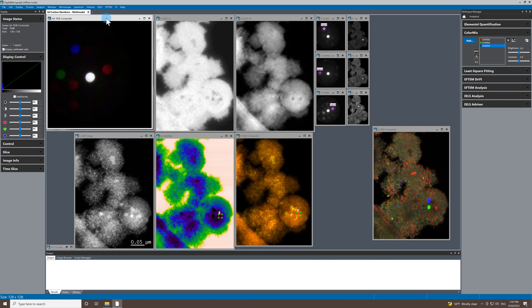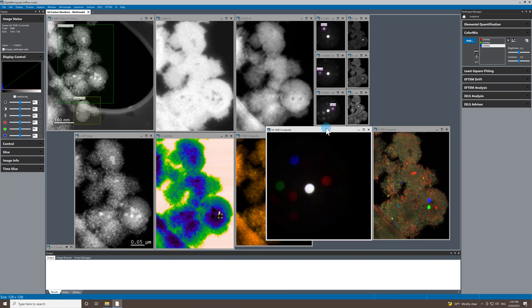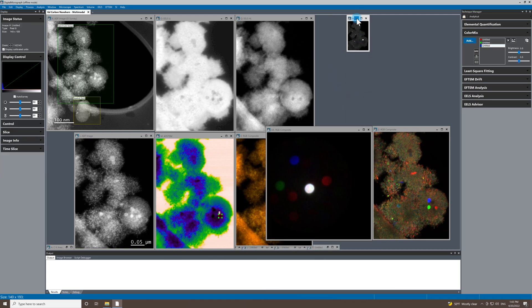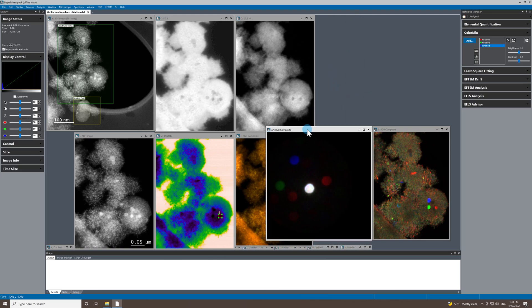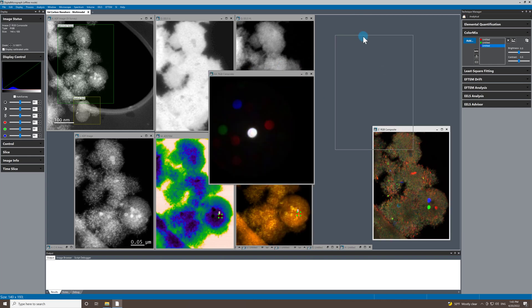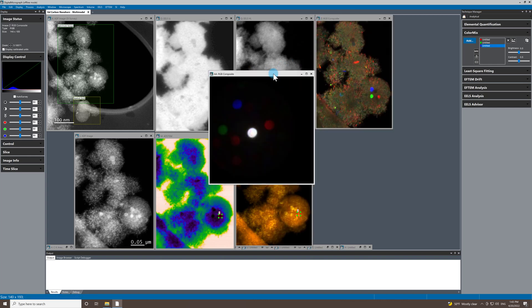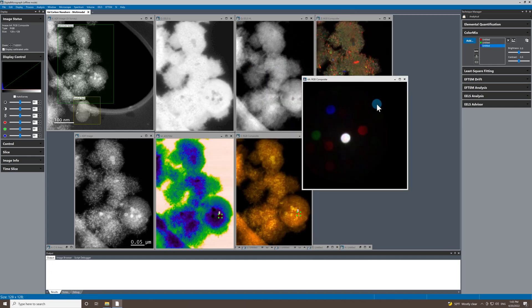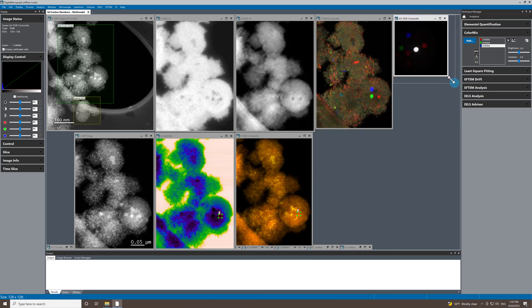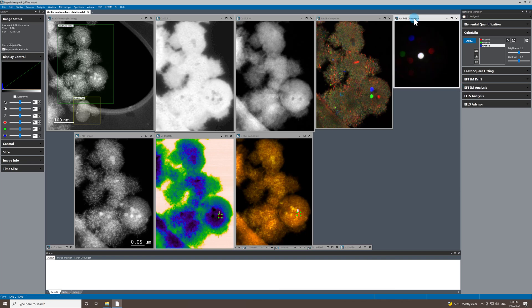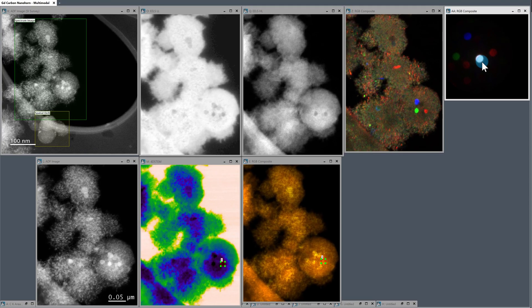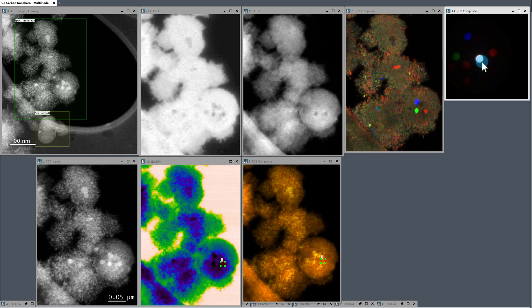Okay, so I have now my reference. So let's minimize all of these and put this up here. Now, this is very useful to do in this way, because we basically have the three overlay diffraction patterns. And obviously, we have the zero diffraction disk, which looks white, because it's in the same place for all of the three diffraction patterns that are overlaid.